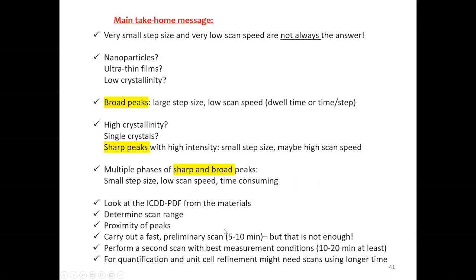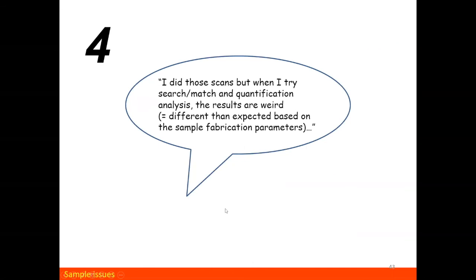For this, it's very important to look at the basics of the diffraction process. I hope you can see a video where the angle of incidence omega is changing and the detector is changing. Dark here in the center is your powder sample. As you change those angles and go to higher angles, peaks start showing up. Those peaks indicate that your material is crystalline. This is the important information for you.